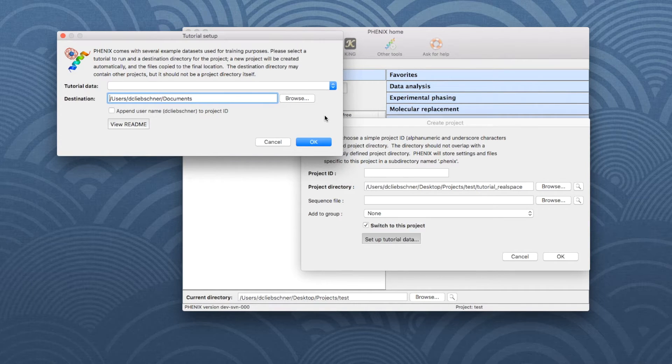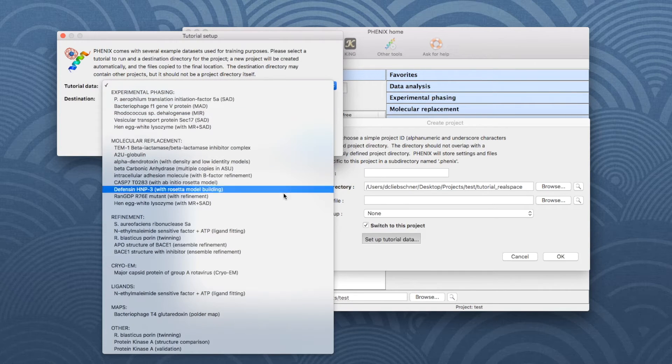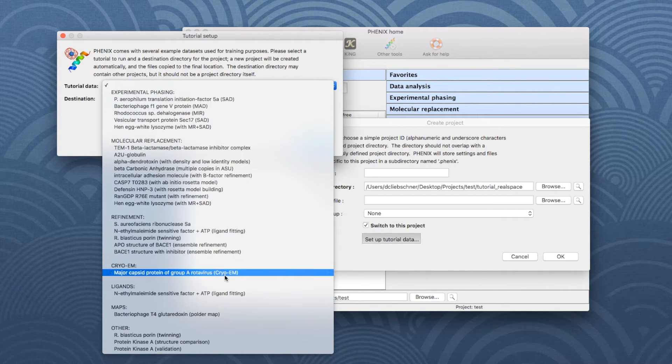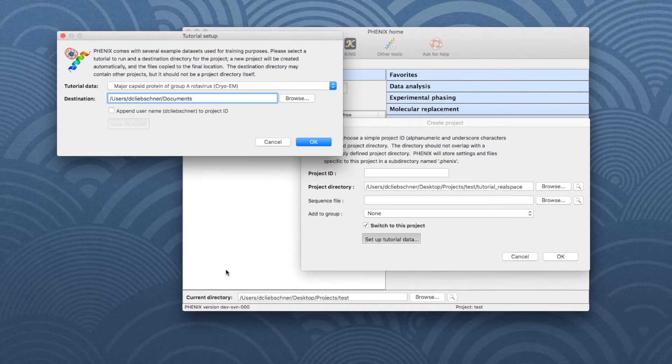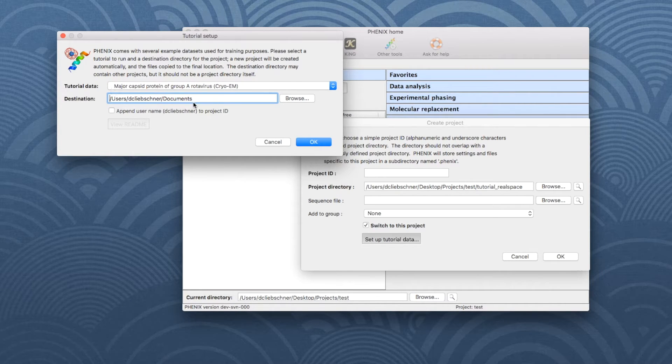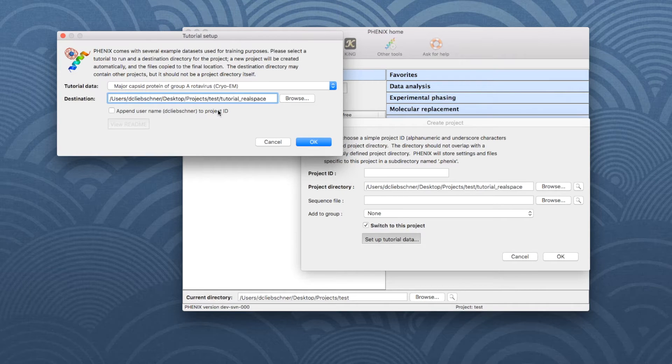Open the drop-down menu next to Tutorial Data. Go down to cryo-EM and choose the first dataset, called Major Capsid Protein of Group A Rotavirus. Choose a directory where the data shall be saved. Then click OK.